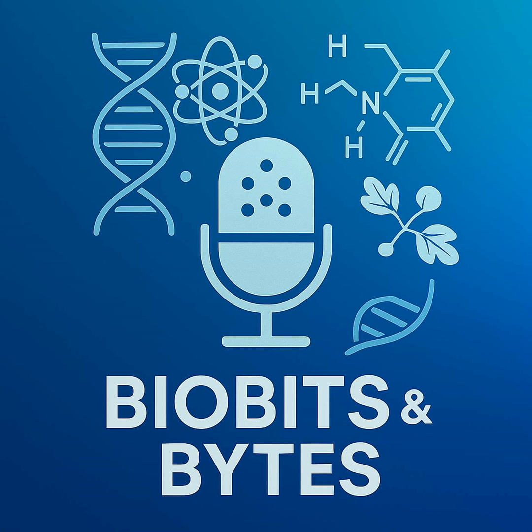Precisely. Then you add your sample. If the target molecule is there, it'll bind to whatever you coated the well with. Then comes washing. Washing is crucial in ELISA. You wash between pretty much every step to remove anything that hasn't bound specifically. Next, you add a detection antibody, which is linked to an enzyme.